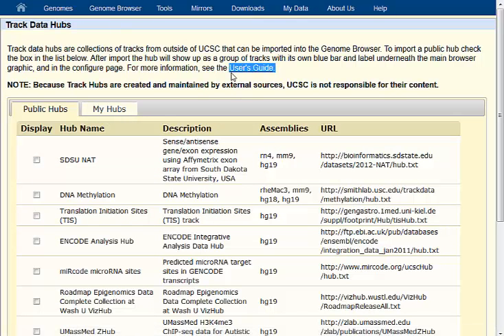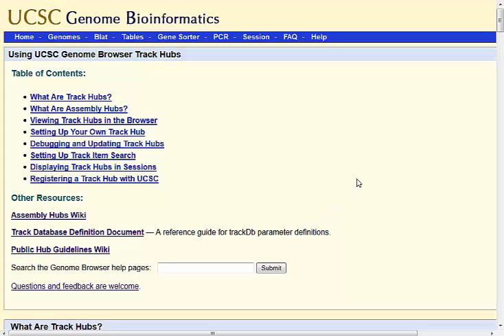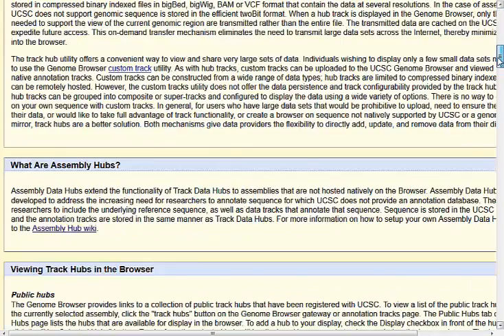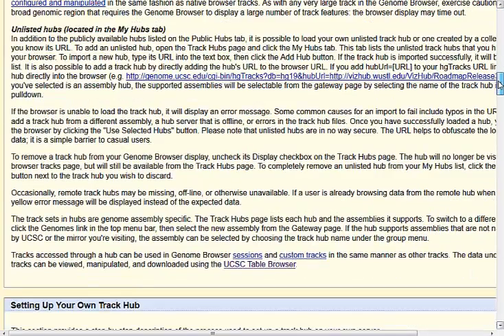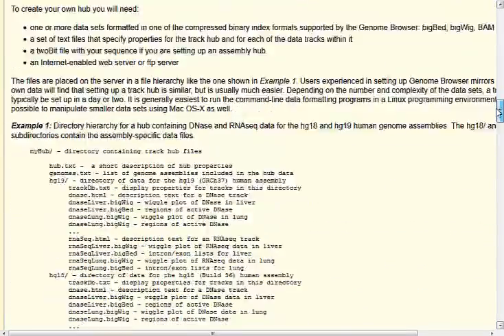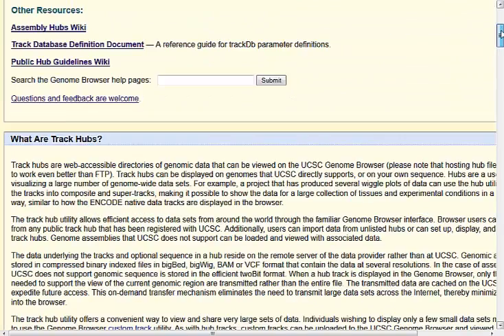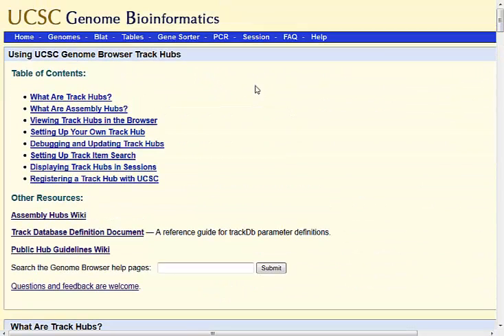The way to start doing that is to take a look at the user guide in that paper I was just referencing. Click the user guide to learn more about that. There's a lot more detail here that will help you understand what these hubs are and how to set up your own structure — the kind of information and the way you have to do that. There's also a wiki and other sites for you to learn more about the kinds of information you need to structure and set up.